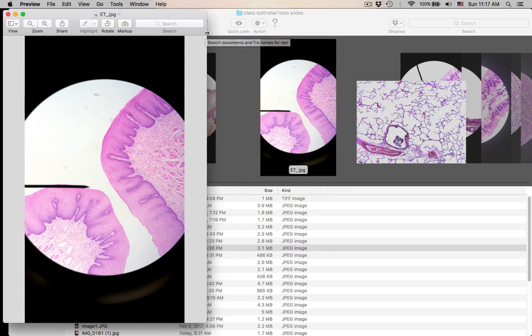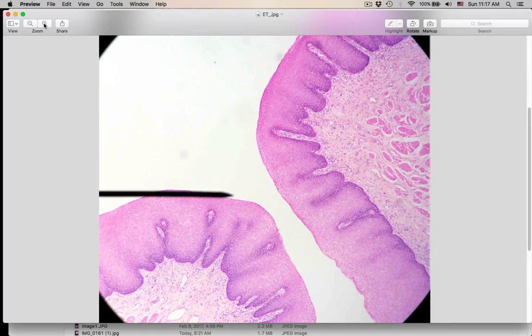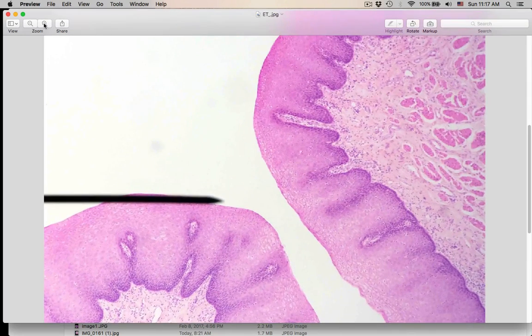And remember, you're going to be repeating a lot of these. These are the same slides, different pictures, different views, but you're going to be repeating the name of the epithelial tissue just to get you in the habit of seeing it over and over again. Pointer in the lumen. This is number 7.